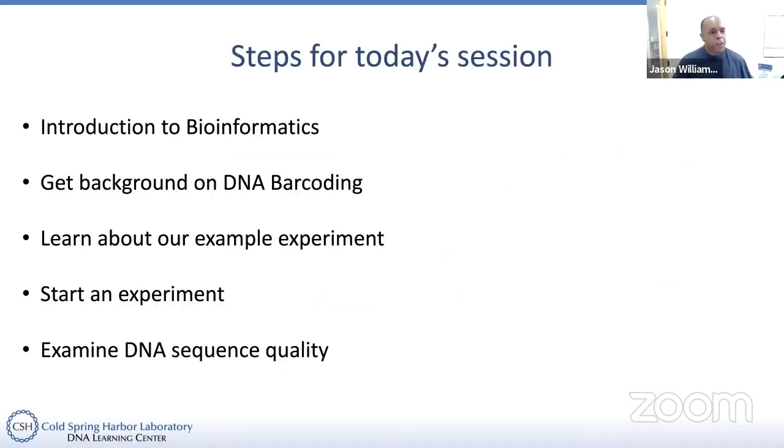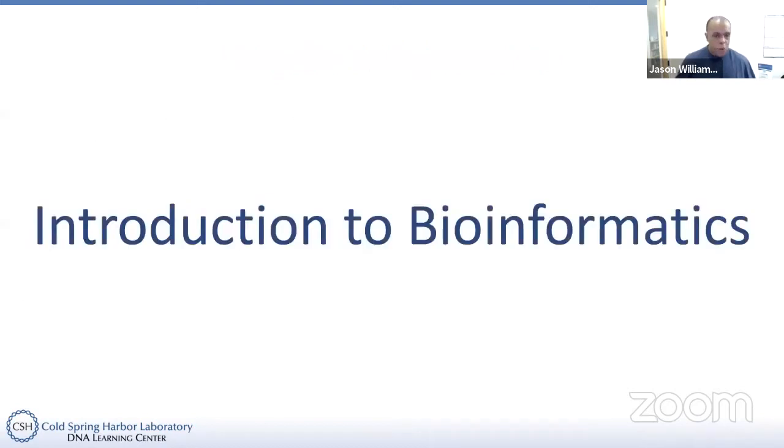The steps that we're going to do: we're going to introduce bioinformatics, get the background, and learn about our example experiment. We're going to be trying to identify some mosquitoes, and we're going to start that experiment and at least get to the quality section. So what is bioinformatics?